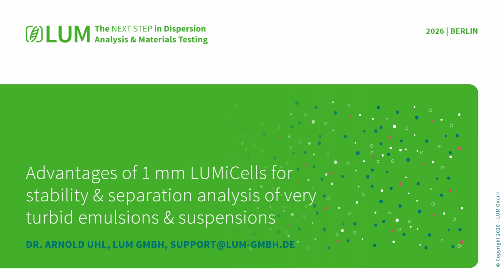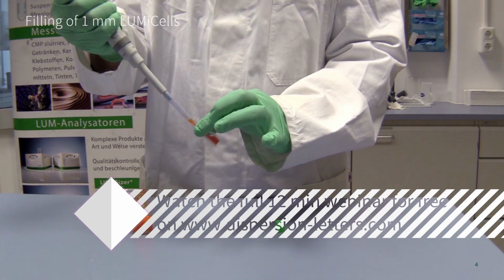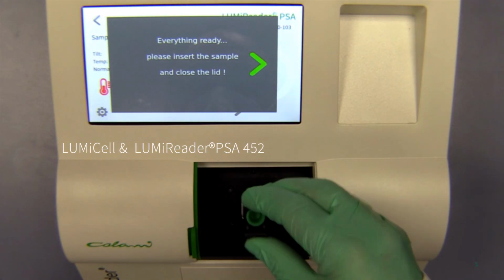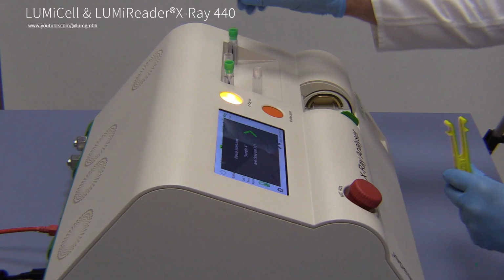It is my pleasure to talk about the advantages of 1 mm LUMiCells. You fill it with a predefined volume according to the instructions which are shipped with the cells, close the lid, and the measurement immediately starts. Very similar once you operate the LUMiReader X-Ray 440.